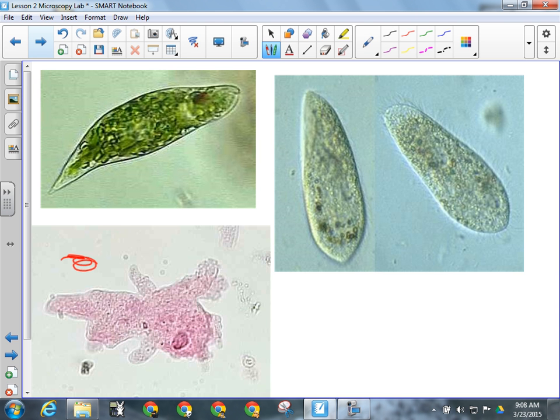around the edges. It's not fur, okay? They're what's called cilia, and they are how it moves. They're little kind of hair-like things. They're not really hair, and they wave them kind of in unison, and that's how they move.